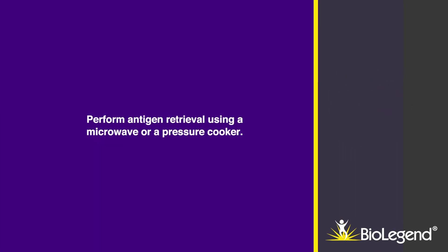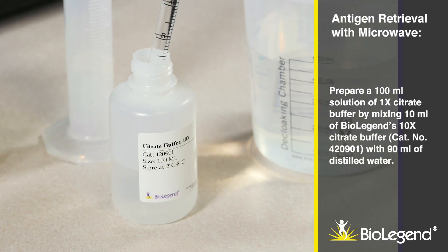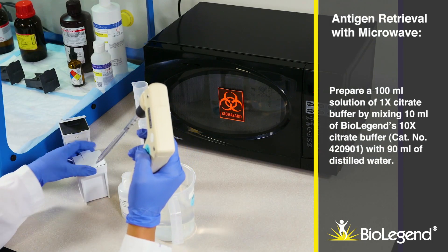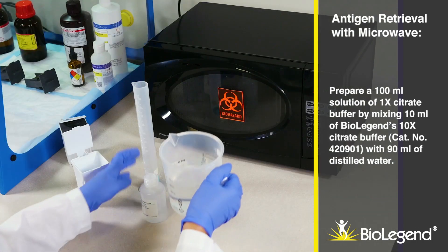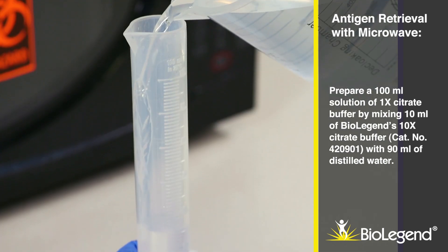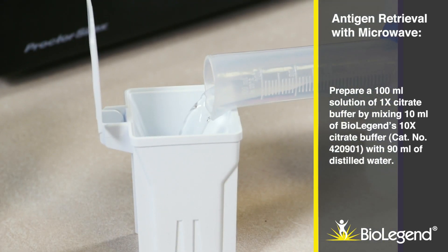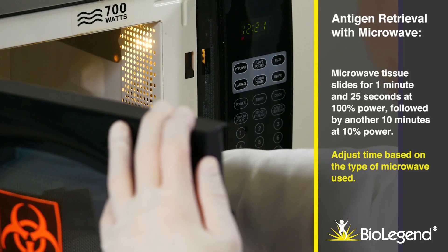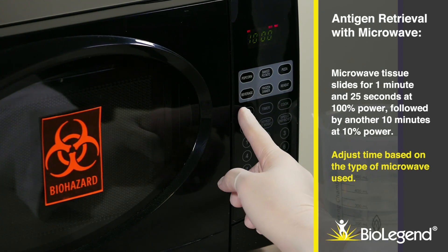Perform antigen retrieval using a microwave or a pressure cooker. For antigen retrieval with a microwave, prepare a 100 ml solution of 1X citrate buffer by mixing 10 ml of BioLegend's 10X citrate buffer, catalog number 420901, with 90 ml of distilled water. Microwave tissue slides for 1 minute and 25 seconds at 100% power, followed by another 10 minutes at 10% power. Adjust time based on the type of microwave used.